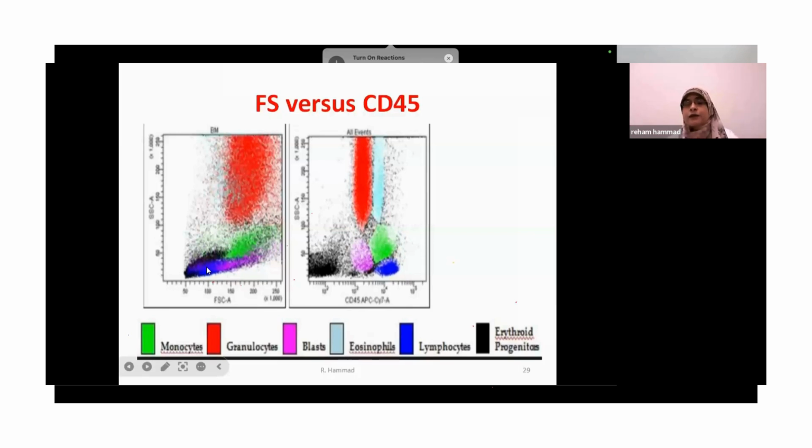But in reality, as you are working inside the lab, the two populations are not magnificently separated as I have been showing you in the last lab.